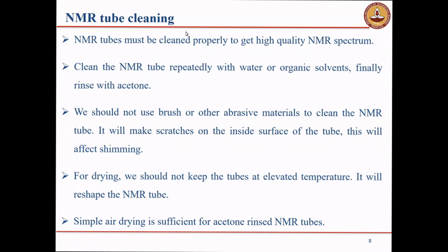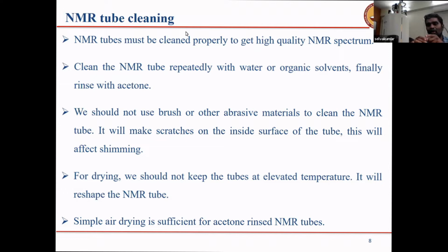This is the NMR tube, and this is the 5 mm NMR tube. The length is 7 inches. The outer diameter is 5 mm. Okay, this is the cap. I'll explain how to prepare the sample later on.